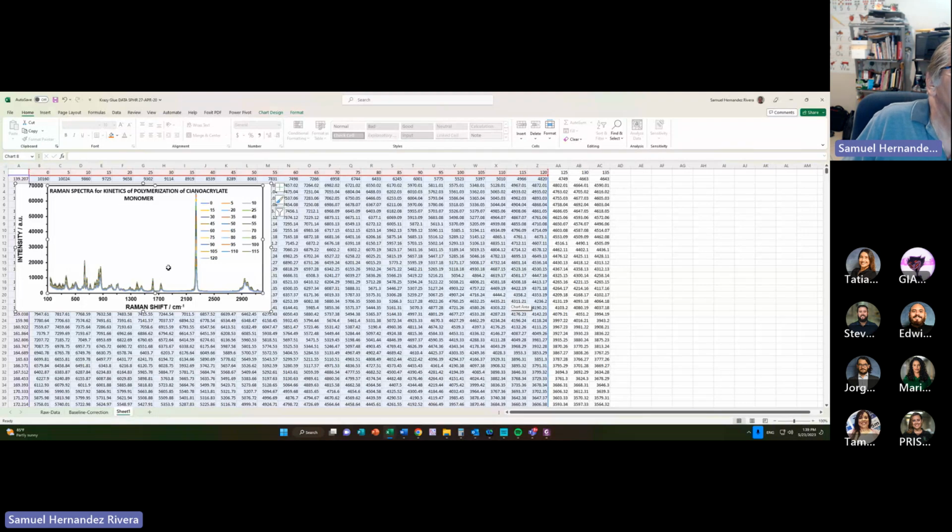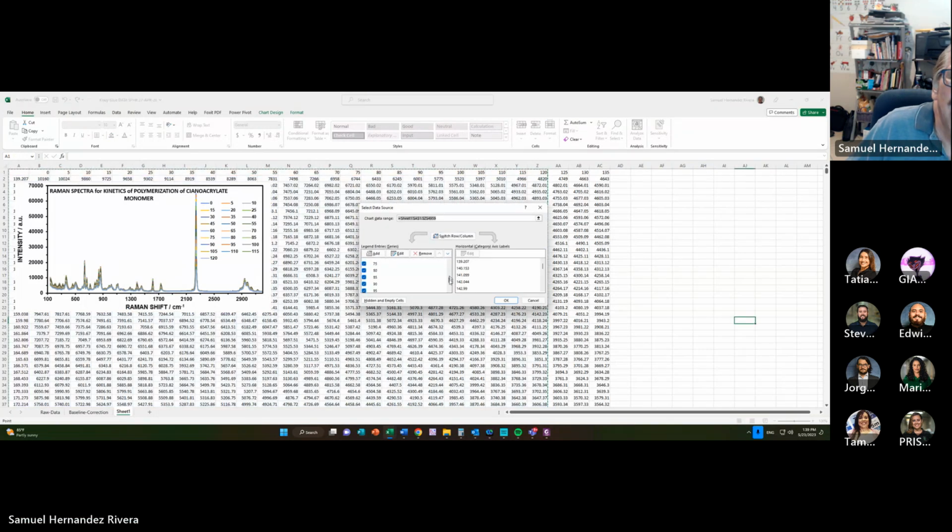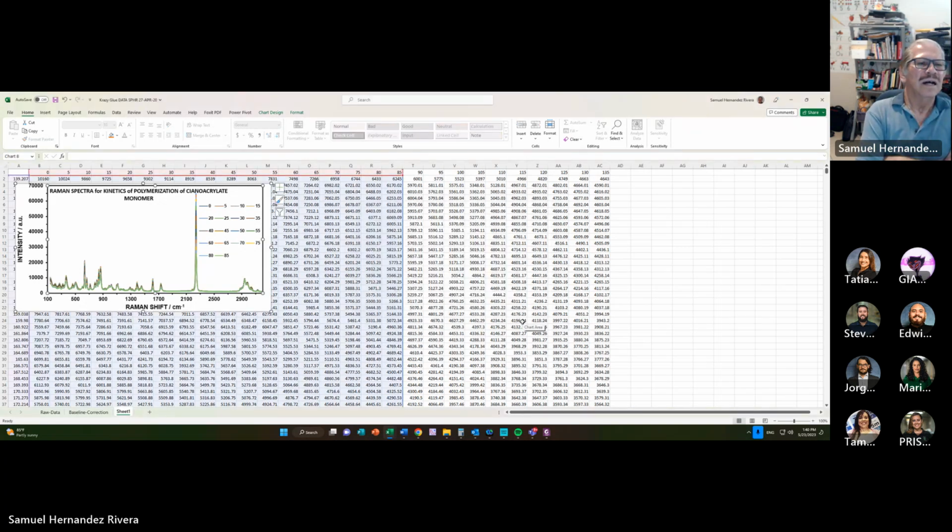I didn't see much change. Let's keep eliminating. Let's eliminate 3 more. Someone to keep the accounting. Incredible. You can hardly notice the change.